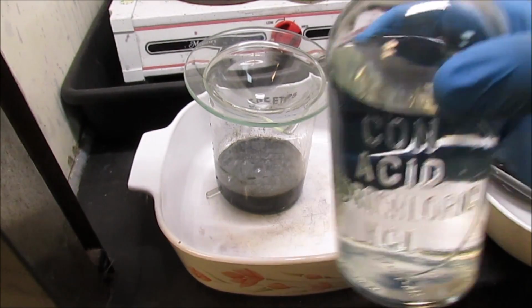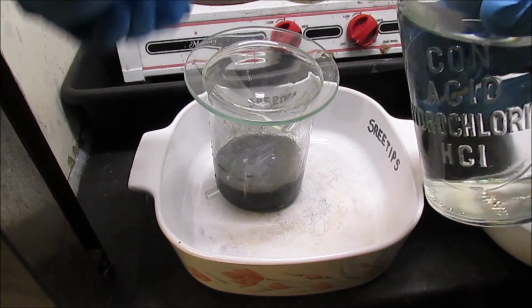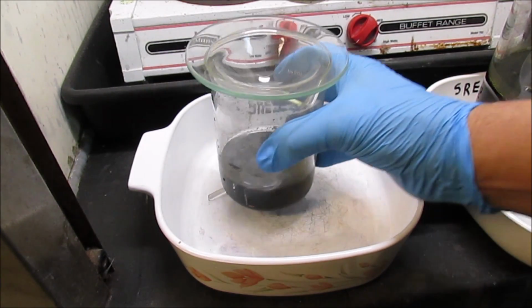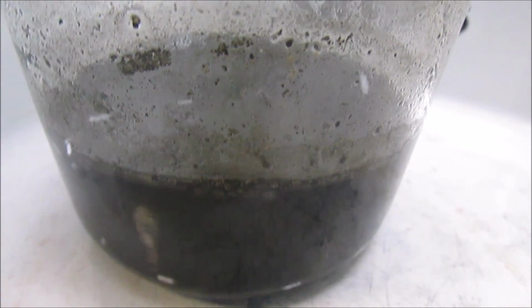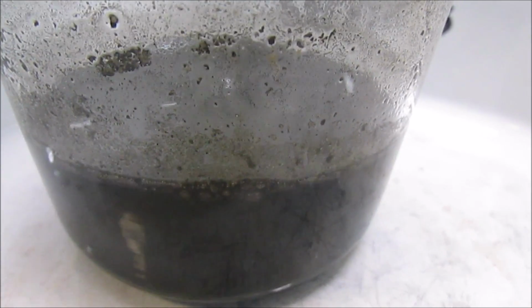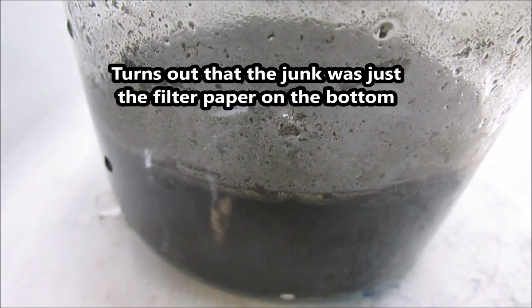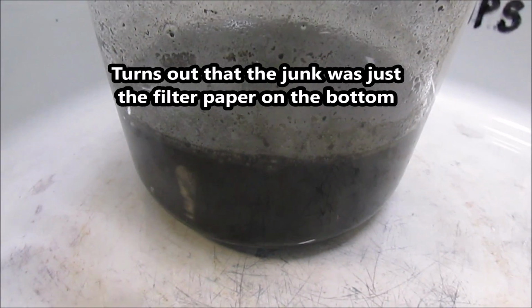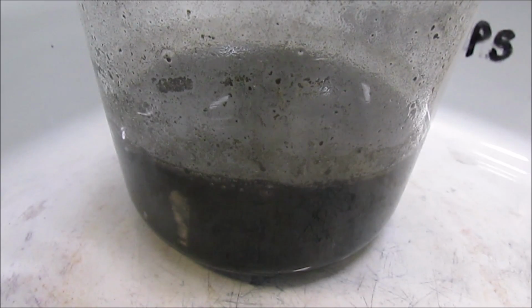A couple of ml of hydrochloric acid here to make a dilute solution of hydrochloric. Burn the rest of the zinc out of there. You can see here that hydrochloric acid is reacting with leftover pieces of zinc in there. I'll keep a dilute solution, 1 to 10, 1 hydrochloric to 10 distilled water, until we get all the excess zinc burnt out of the black PGM powder.